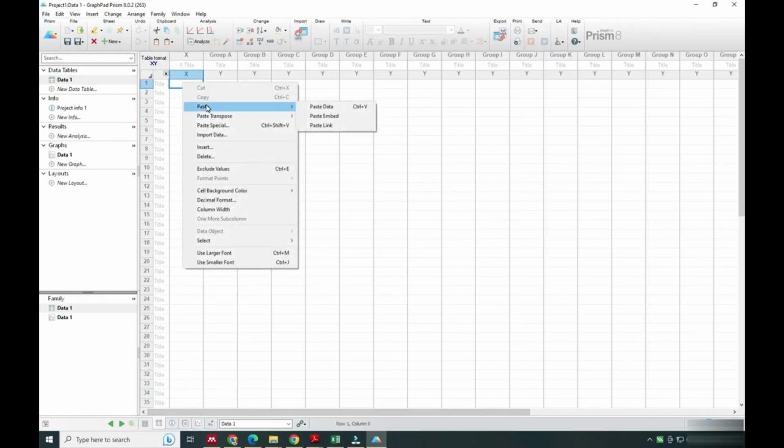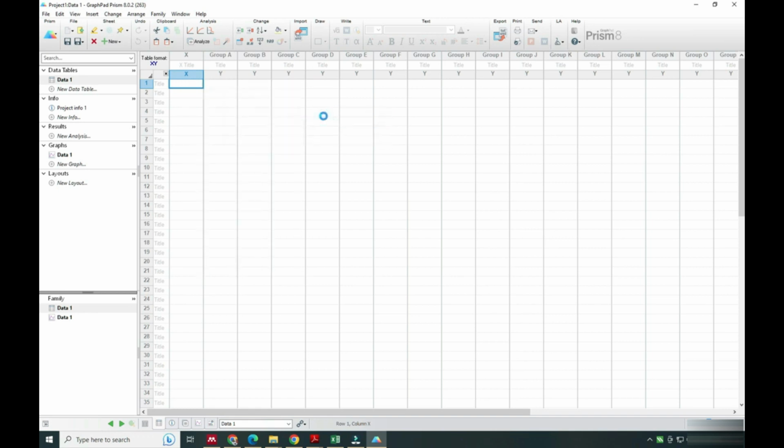and this is how we will paste it. You can see, and now you can write here the minutes or hours of the time point. Next we will place the readings we have collected, that is mg per ml or anything, depending on your drug or the concentration you are going to analyze in the pharmacokinetic study.